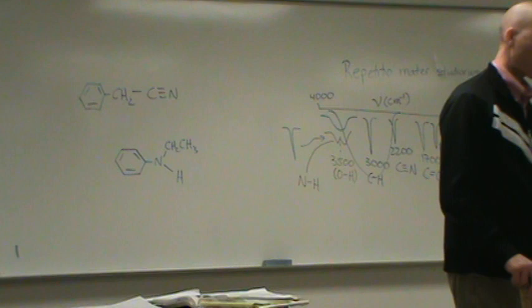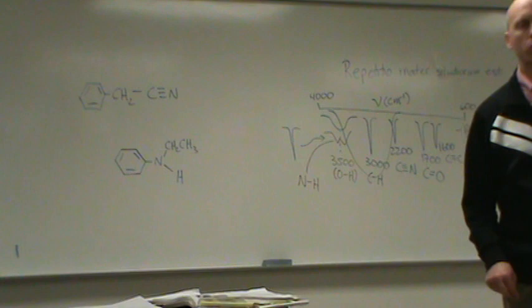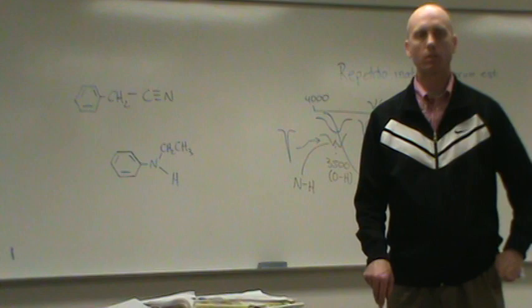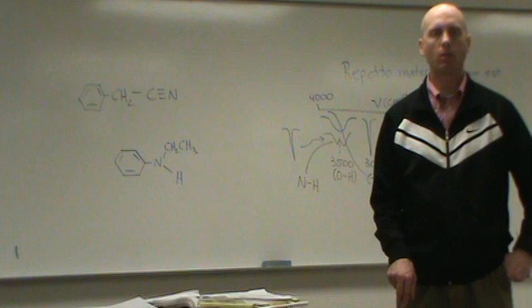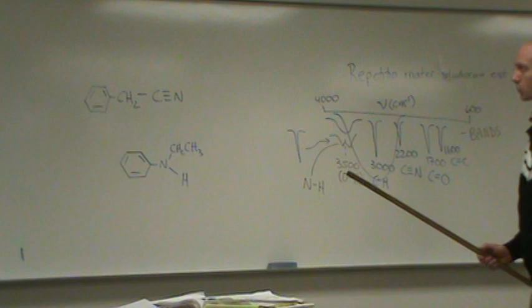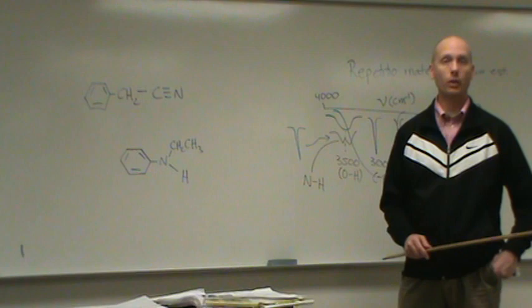Which of these two molecules, okay, go with red, which of these two molecules is the middle spectrum? Okay, I'm asking him. The first. Why is that? Because it has a peak at 2200. Which is that C triple bond N. Good. See how that's still got like a sore thumb? Okay. Boom. The other one didn't have something at 2200, did it?